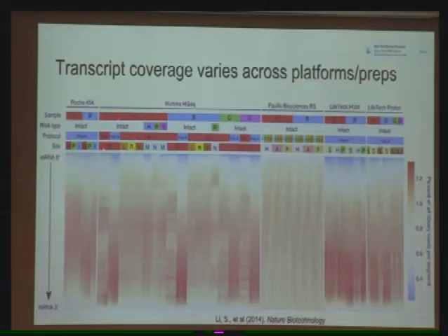Whereas with Illumina, they designed it so that there were many different sites because they were also testing these different protocols and ways of degrading the RNA. So that's just part of their experimental design, that they had different numbers of sites running different numbers of experiments because they wanted to compare combinations of these things.